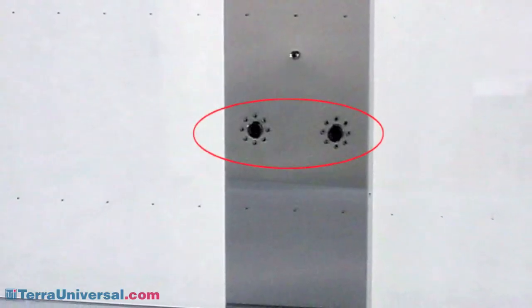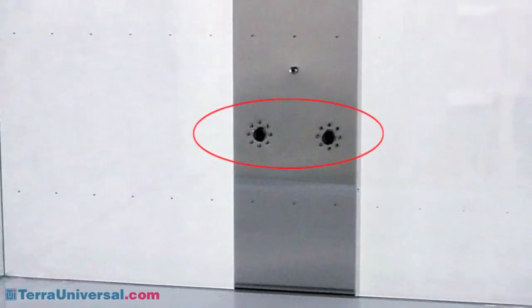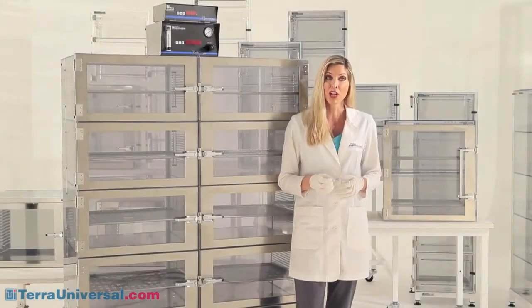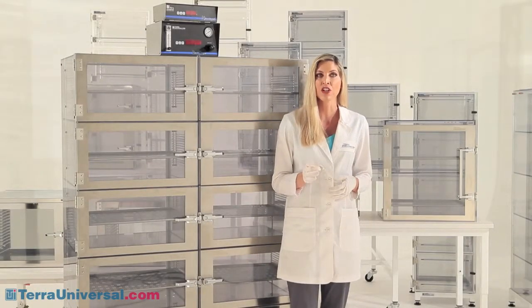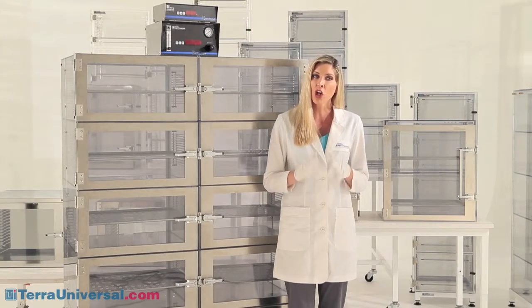Optional ionizing modules enhance ESD safety by issuing a balanced stream of ions that neutralize static charges throughout the cabinet. Multi-chamber desiccators feature a plenum wall that adds strength to the cabinet and ensures that nitrogen, introduced at the top of this plenum, enters all chambers uniformly.